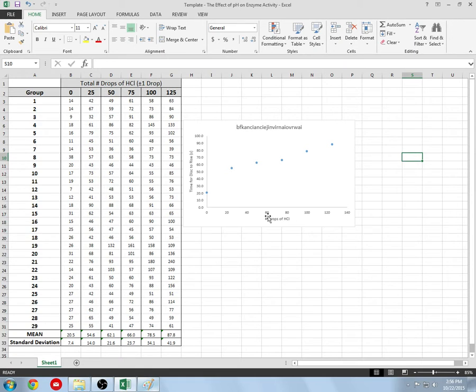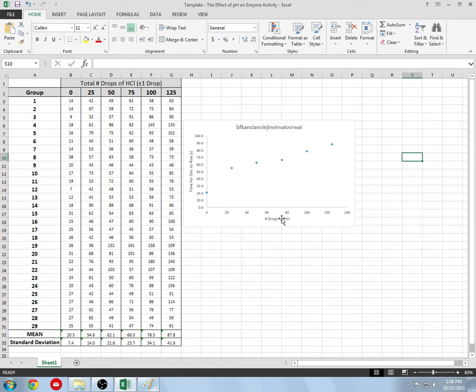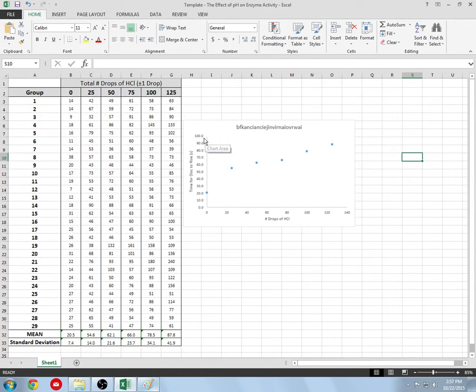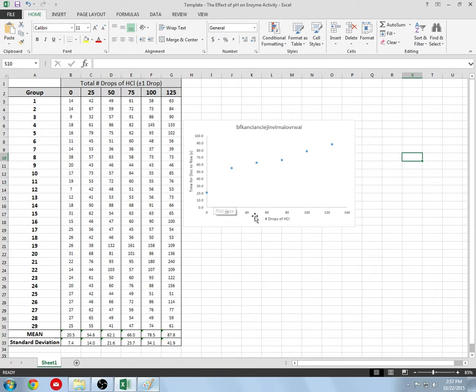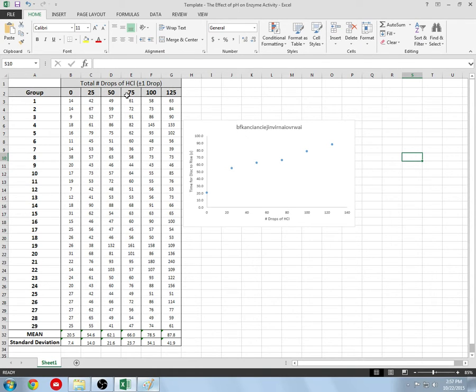Now that we have that done, we have our axis labeled and our graph labeled. Now we want to format these rows and columns. I'm looking at my y-axis, it looks pretty decent, goes from zero to 100 seconds, so I'm not going to mess with that.